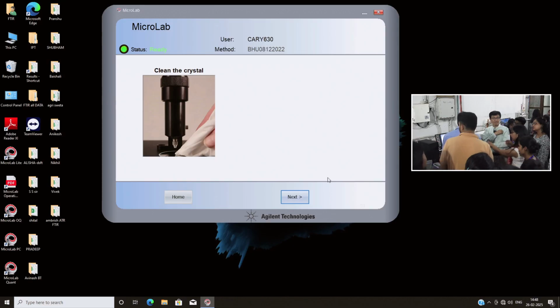In that region, whether silicon or germanium is the crystal, it was not fully reflected. Means in every case at that point, that wavenumber, there will be no reflections for air. For the particular crystal which we are using, it depends on that. Okay, either germanium or silicon. To be clear.